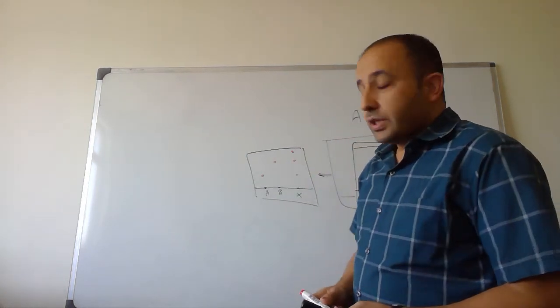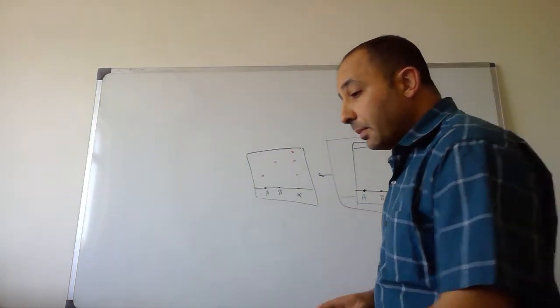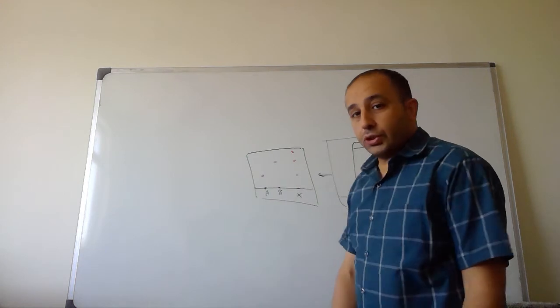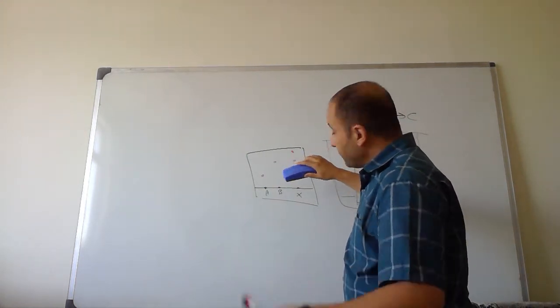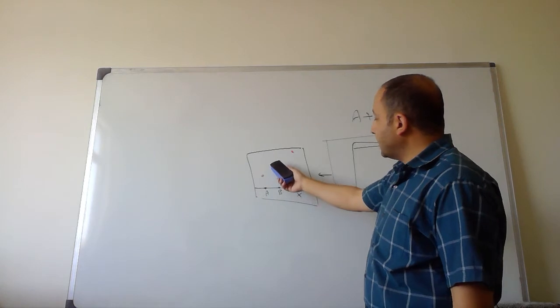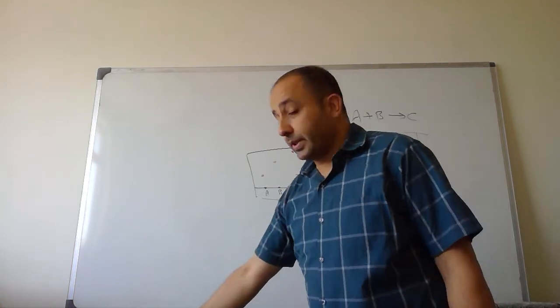This means that this new spot is most probably for what? For the product. But the reaction is still proceeding, because the spots for A and B still appear. Now, if one of them disappeared after a certain period of time, this means the reaction is finished, because we consumed the compound B totally, although we have A in excess and also we have the product.